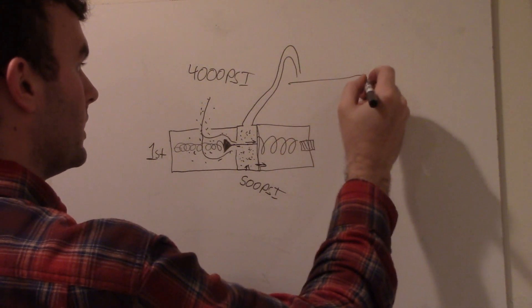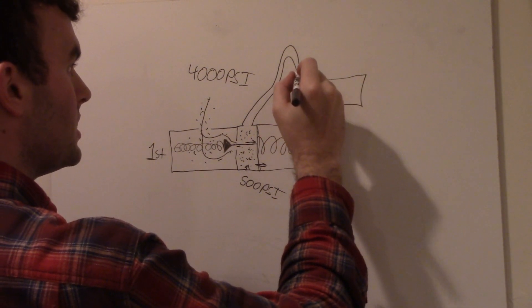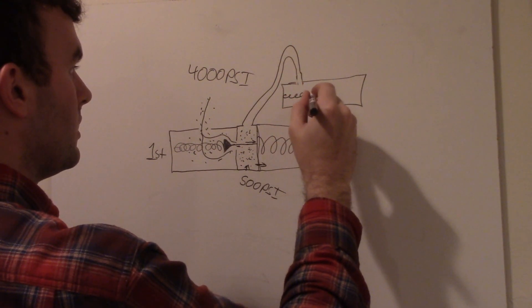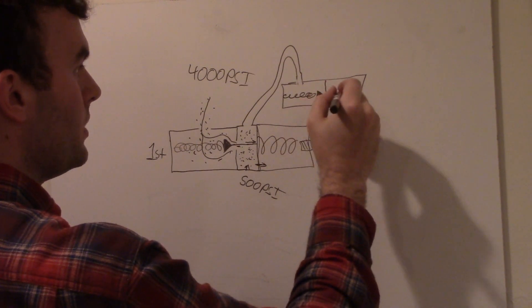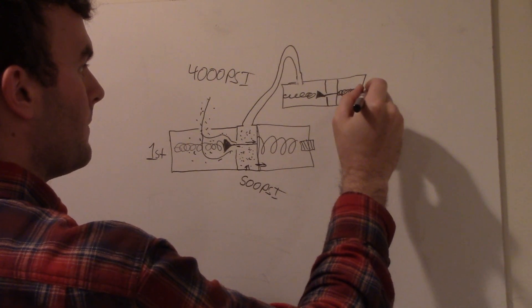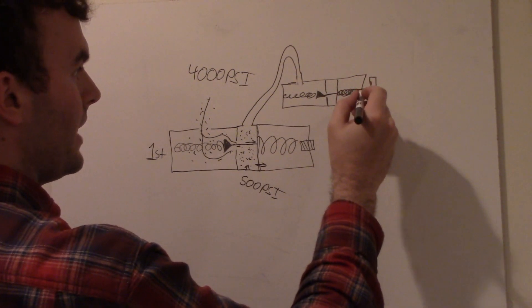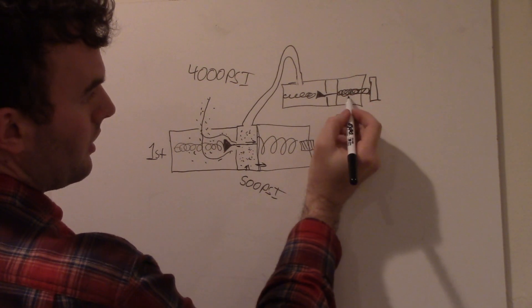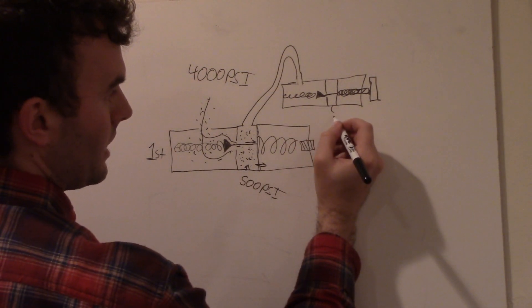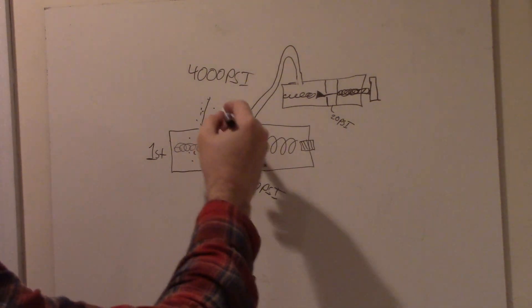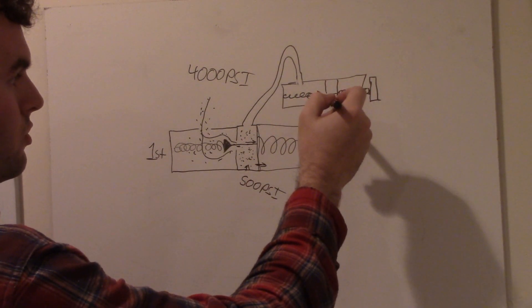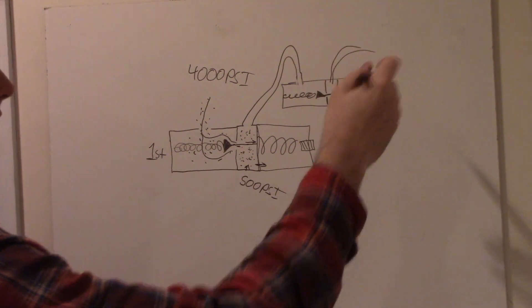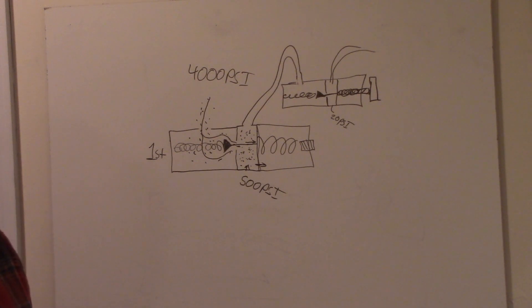And then there was another opening that fed into a second regulator, pretty much the exact same design as the first. So you've got another spring pushing on a valve that's trying to close up an opening, but then you've got a diaphragm and another spring, and then a screw that you can set with this hand thing that changes the pressure on this spring. And so this might be at 20 psi. The advantage of the two regulators is that if you start flowing molecules out of this regulator, the pressure doesn't change as much for a given flow rate as it would with a single stage, because you're not going from 4,000 to 20—you're going from 500 to 20.